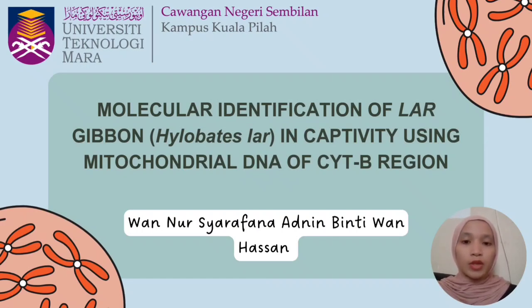So I would like to share about my research project entitled Molecular Identification of Lar Gibbon, Hylobates lar in Captivity using Mitochondrial DNA of Cyt-B region.